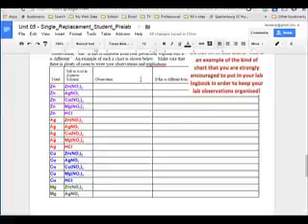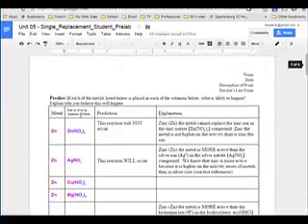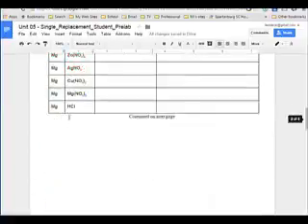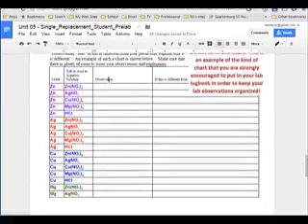All right? So, if you notice, in the first column here, I've got metals listed. The second column, I've got all the solutions. It's just the same set of information as in this chart up here. But I've got a couple different columns here. This column is for observations. So in the lab, you're going to have a place for observations. Now, when I put it here, I didn't leave a lot of space for observations. You've got to leave a lot more room for observations in your lab logbook. And that's why I'm taking the time to help you see that. So let's go to your lab logbook.